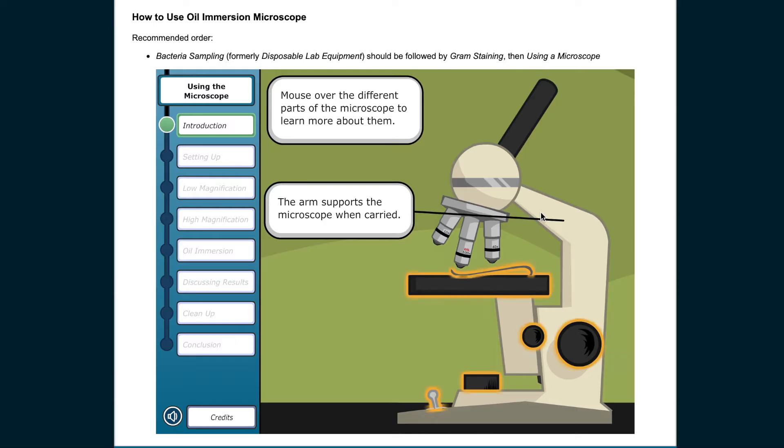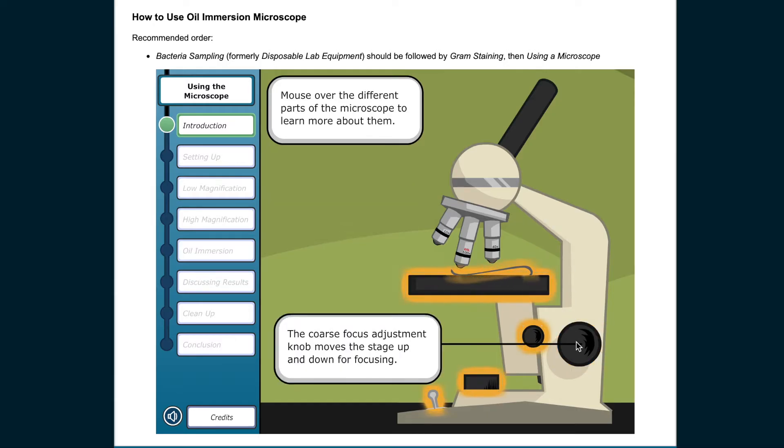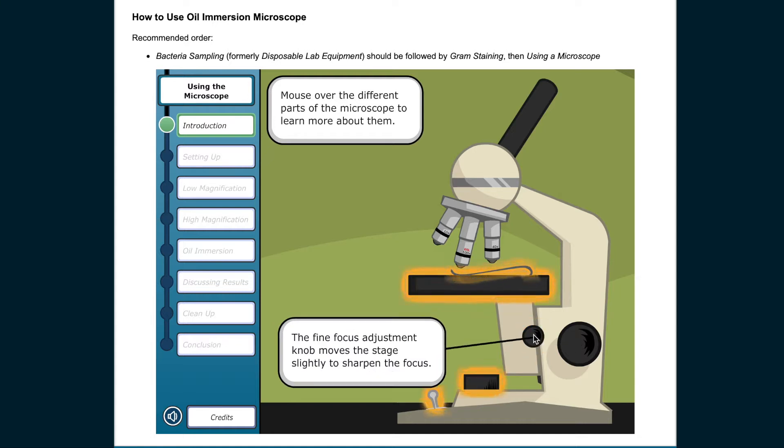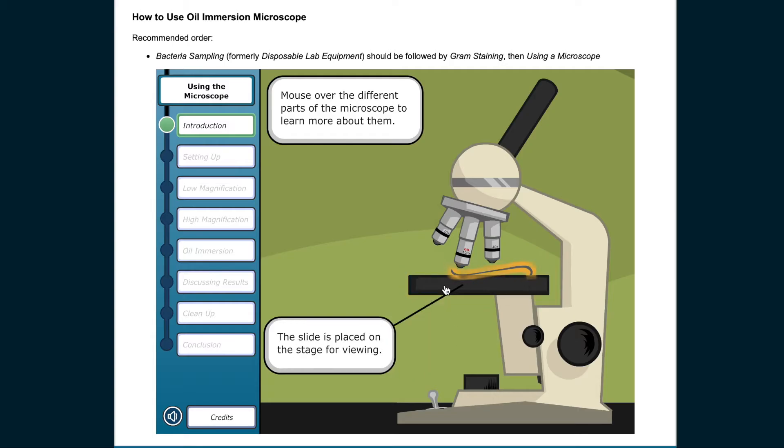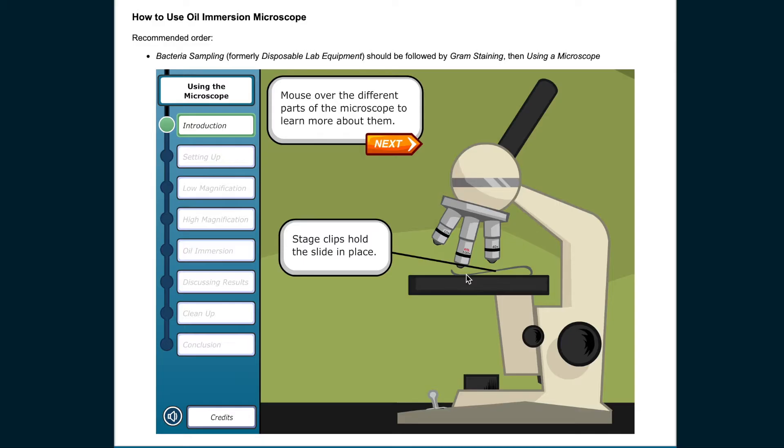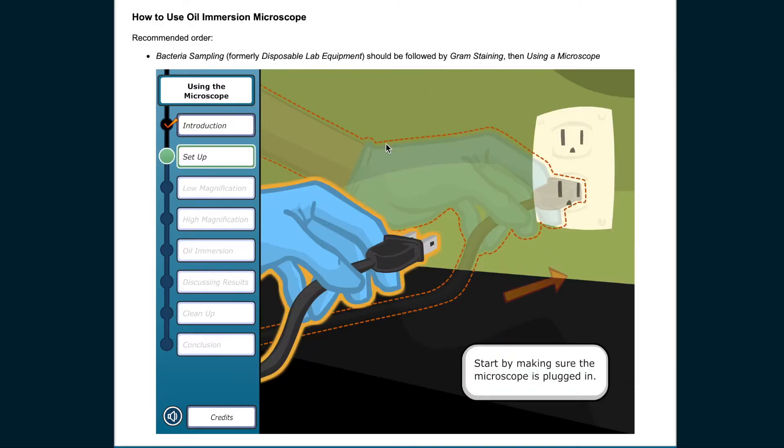The arm supports the microscope when carried. The coarse focus adjustment knob moves the stage up and down for focusing. The fine focus adjustment knob moves the stage slightly to sharpen the focus. The diaphragm adjusts the amount of light on the slide. The light source projects up through the slide to illuminate the sample. The slide is placed on the stage for viewing. Stage clips hold the slide in place.